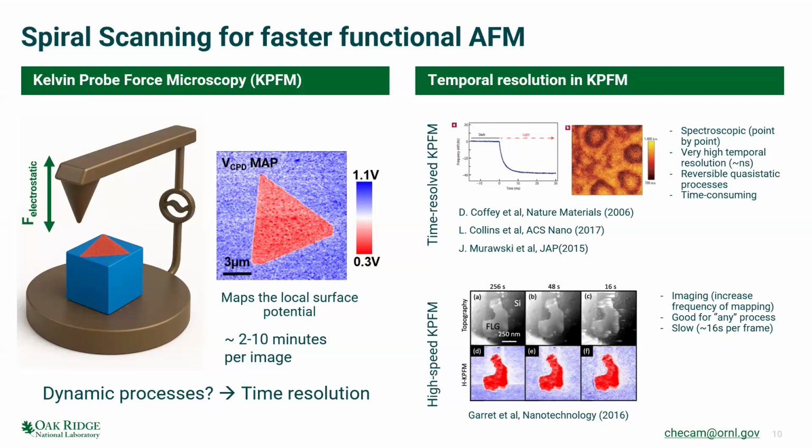I think the key in these samples is that the polarization wants to be in plane, but there's also this sort of hierarchy of the superlattice. So you have small A1, A2 domains, and the interaction between those is what drives these weird polarization states when you scan in spiral, right? So the answer is because we had it and it had in-plane domains.